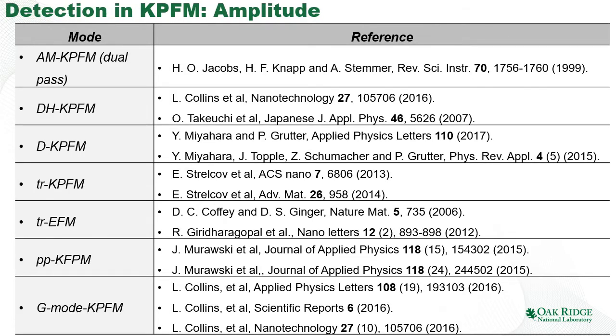So notice that many of these techniques are not commercially available, so the commercial machines are sufficiently flexible to implement them, but most of the time you need to have a reasonably good idea of what exactly aspect of material physics or chemistry you want to look into that informs your choice and configuration of the KPFM mode.